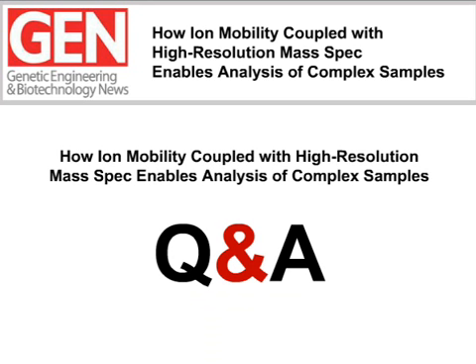Okay, thank you, Jessica. And John, a question for you. Have you seen any fragmentation occurring during IM? Yeah, that's a great question. On the earlier home-built instruments, sometimes we would see it, depending on the ion source used, to a greater extent than some of the softer sources we see today. But what that manifests itself as is a streak of signal corresponding to the elution of the precursor ion.